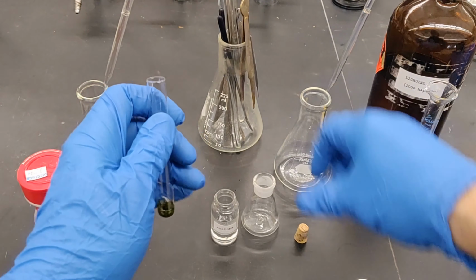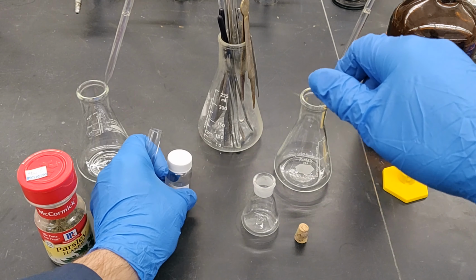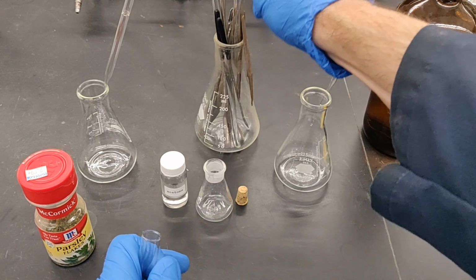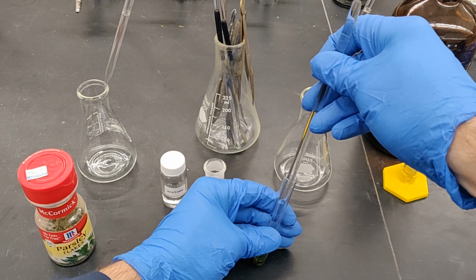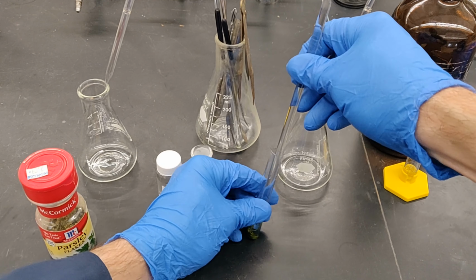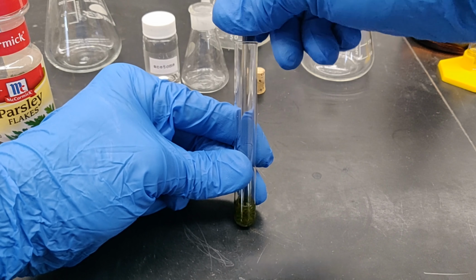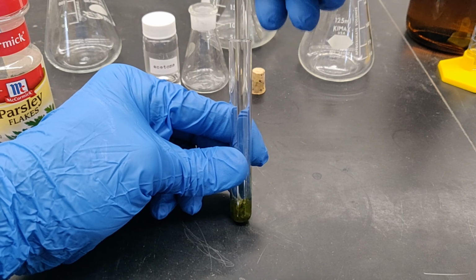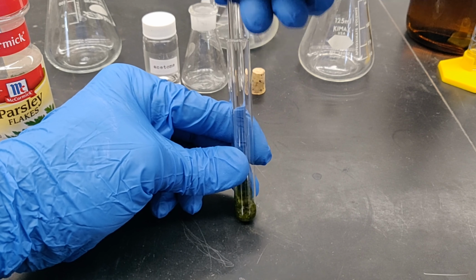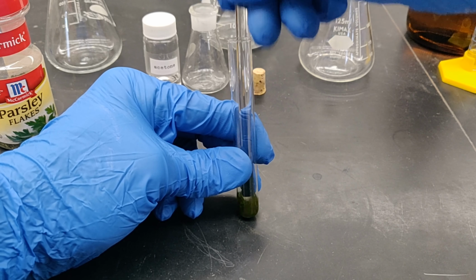The solid liquid extraction is performed by using one hand to securely hold the bottom of the tube while keeping the tube bottom resting firmly on the benchtop surface. In the other hand, use a sturdy glass stirring rod to grind and crush the suspension of plant material and solvent. The rod should be held close to the tube opening while grinding, and excessive force should be avoided to prevent puncturing the tube or snapping the glass rod. Do this for a full 2 minutes.